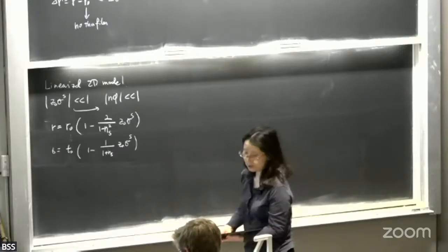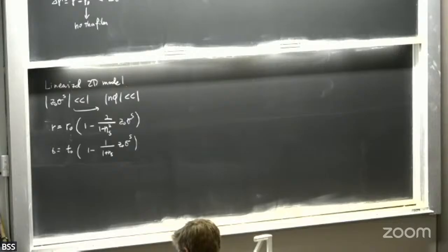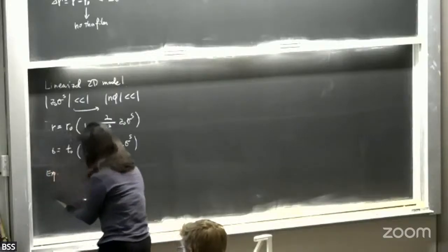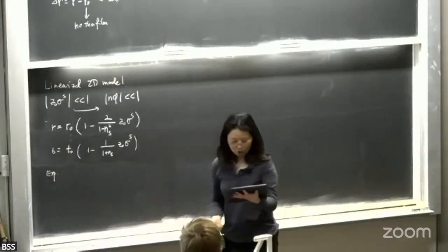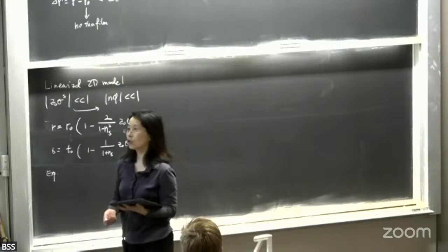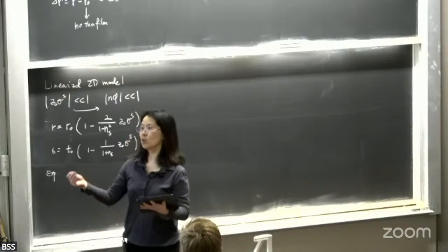So now this looks kind of simple. And then for the experiment, if we come back to the setup, what I can do is move my sample, so say my sample is at one location and I move to a different part of the substrate with no sample. So I can look at, for example, the change in transmission or change in reflection. So this is easy to do. In experiments, I'm going to look at differential reflectance or differential transmittance. Sometimes this is also called reflection contrast or transmission contrast.